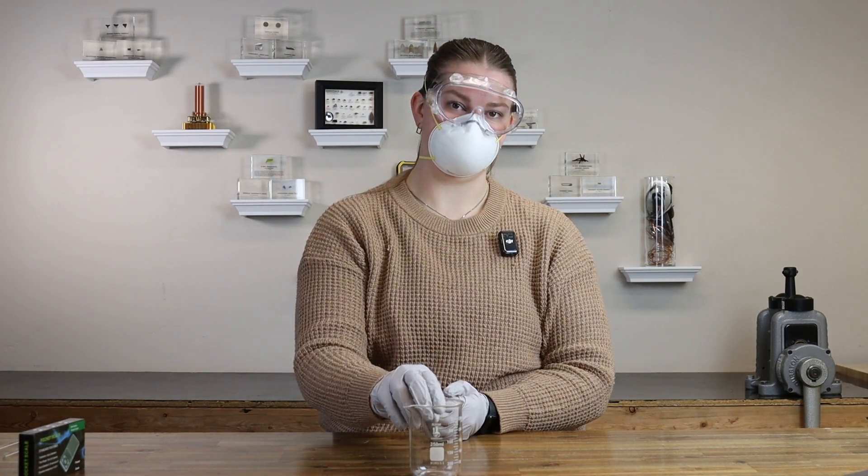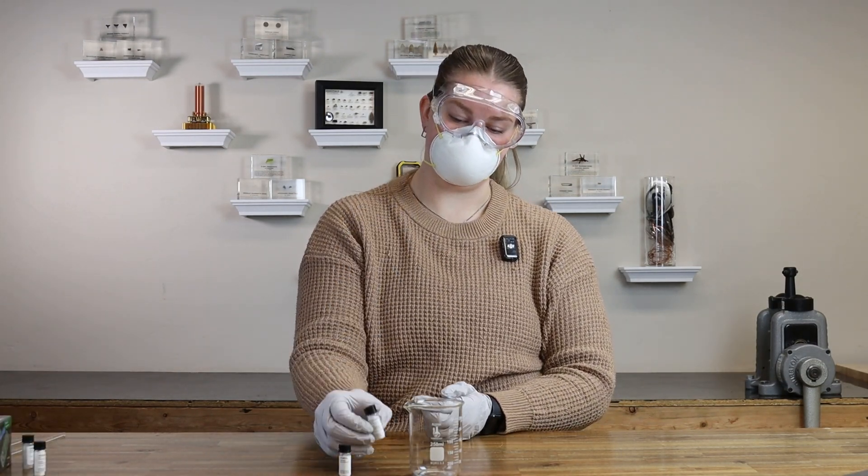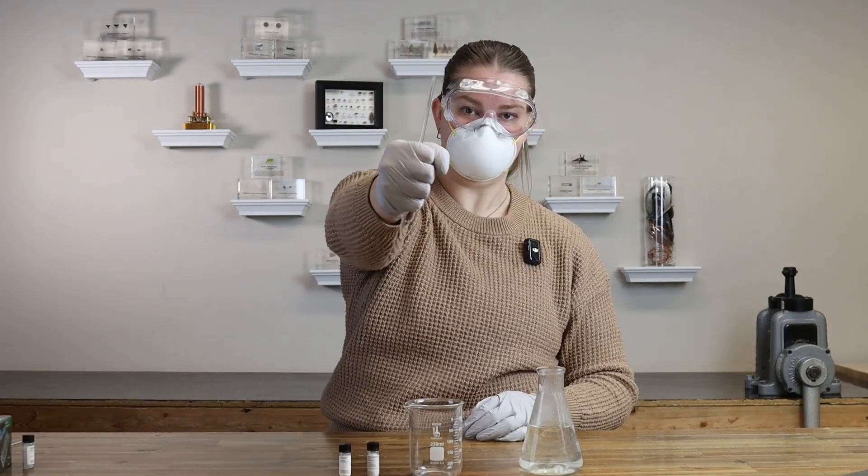Solution A: beaker, starch, sodium metabisulfite, water, stirring rods.